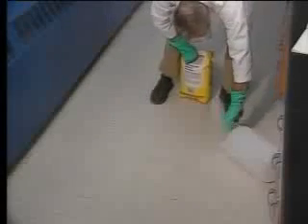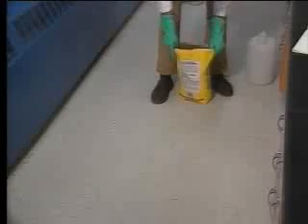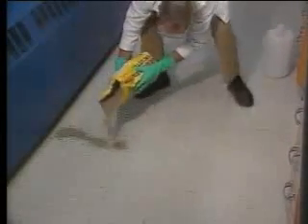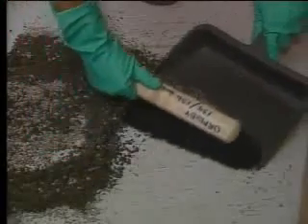At some point in your laboratory work, you'll probably spill something. You should report spills immediately. Stay away from the spilled chemical and let your teacher clean it up. To keep a large spill from spreading, it's barricaded with an absorbent material such as kitty litter. It's then either mopped up or covered over completely with the absorbent. The absorbent and chemical can be swept up with a broom.